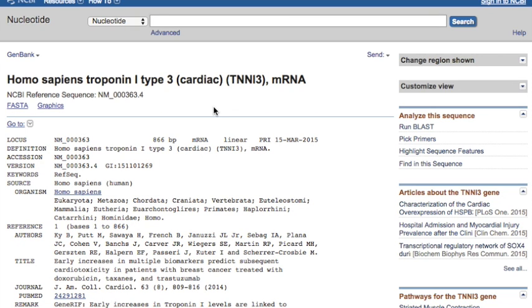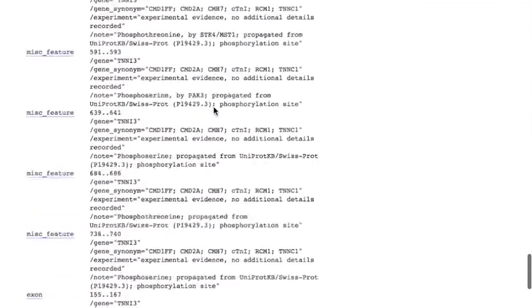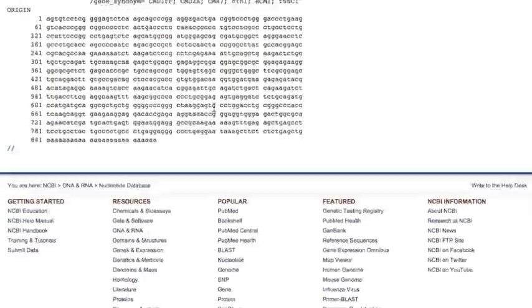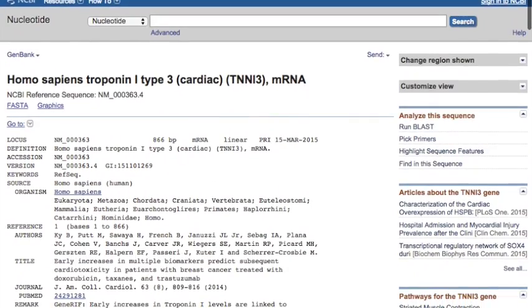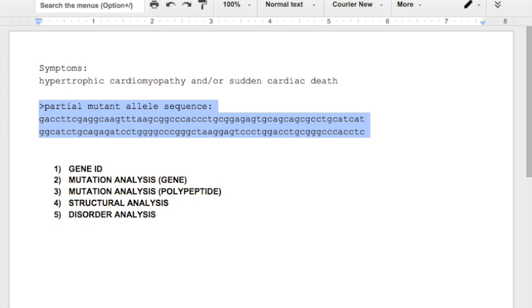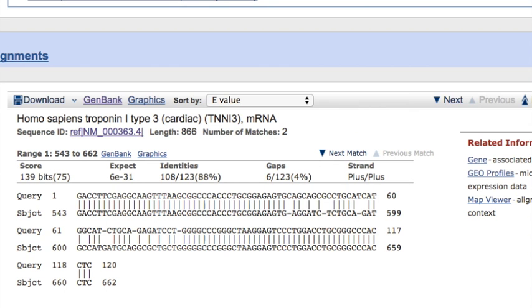This is showing that a number of nucleotides are identical to what we searched with, but then from here on out we have a bit of a difference. If we want to learn more about this particular gene, we can click up here on GenBank or go to a few other resources that I'll show you. But we're going to start here. On GenBank, this gives us a great deal of information. At the very bottom of the page, if we scroll down, we get the complete mRNA sequence.